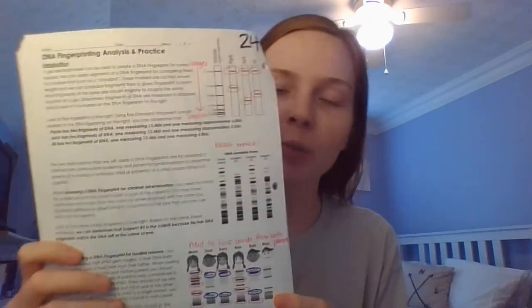Okay, I'm going to teach you how to look at DNA fingerprints and then analyze them. So we are on pages 24 and 25 of your packet. And so a DNA fingerprint is basically any time that you have cut up a DNA sequence and then you run it on a gel.